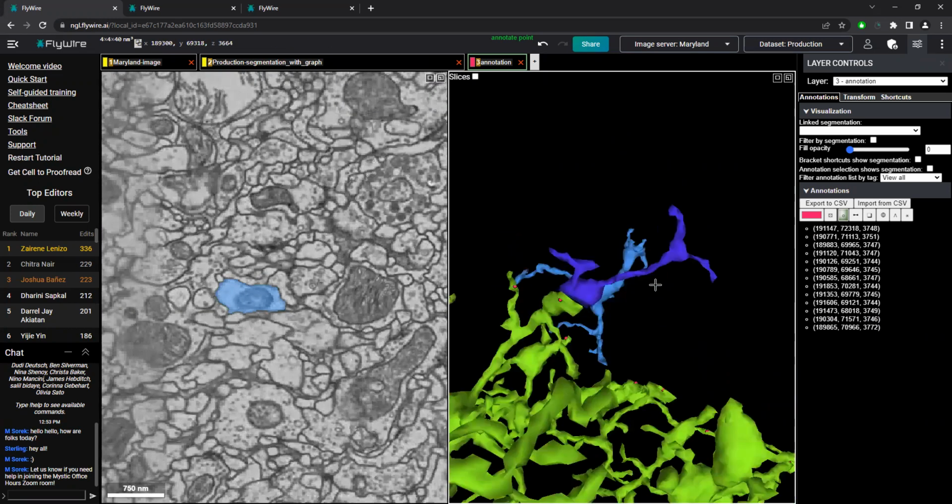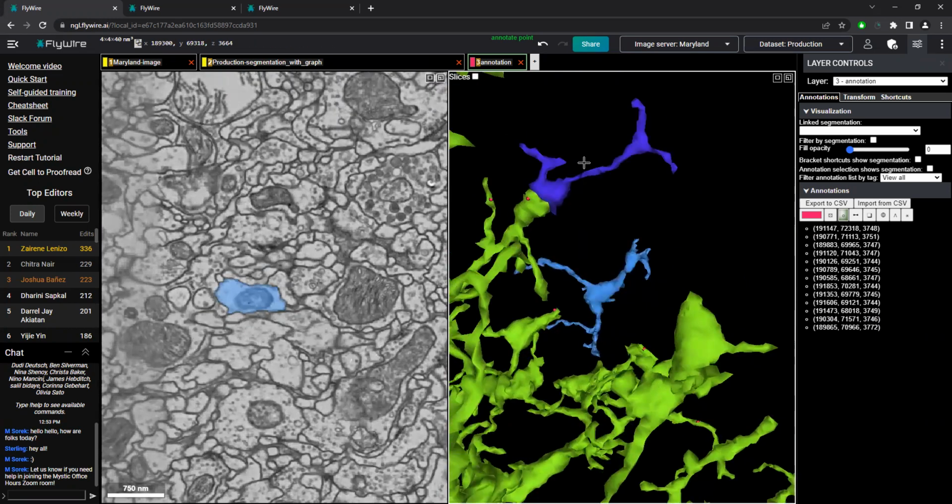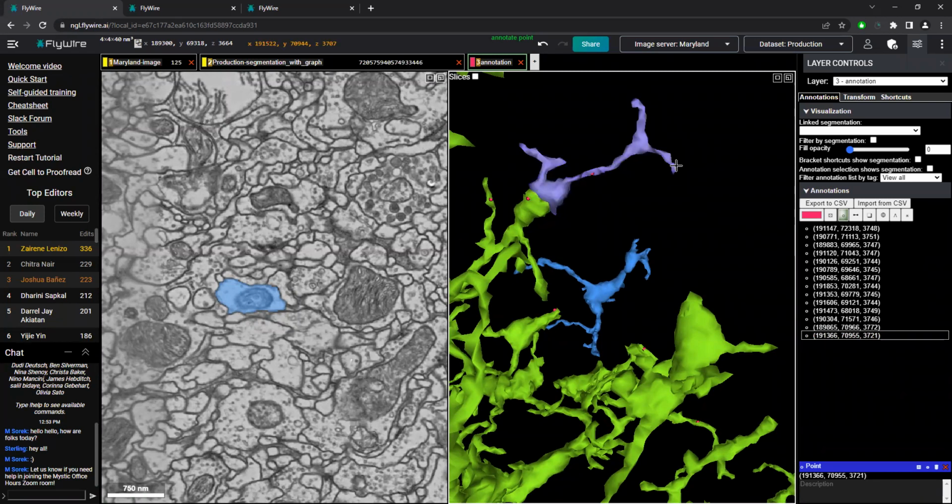This one, if you maybe didn't add on from this annotation point to the right, like this Y shape, and you missed adding that, it wouldn't be a huge issue. That's something that the AI we're training, we're hoping, would be able to add on if that got missed. But in general, this is big enough that we want to make sure we add it.